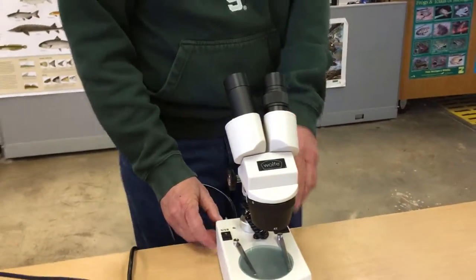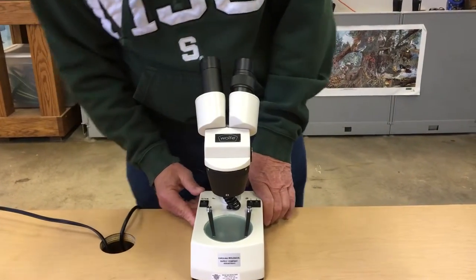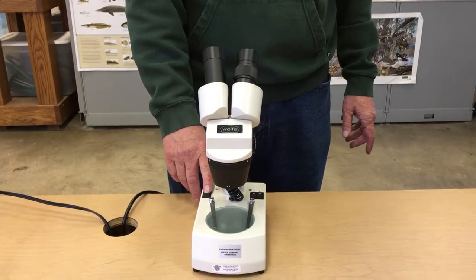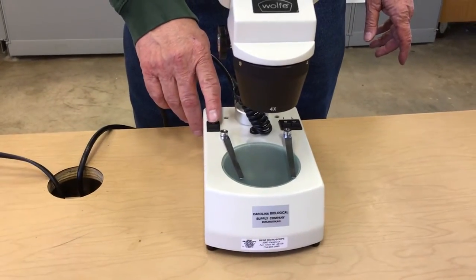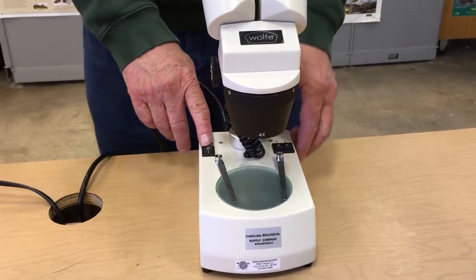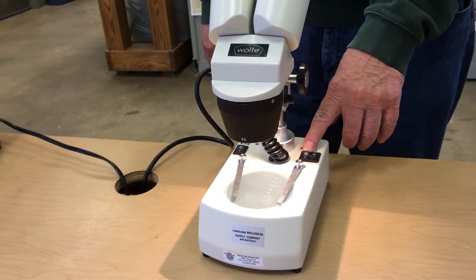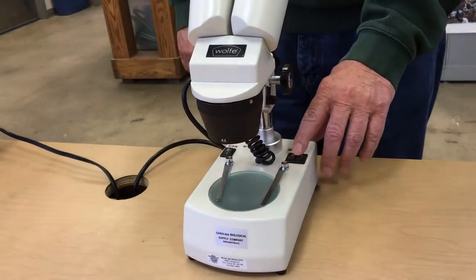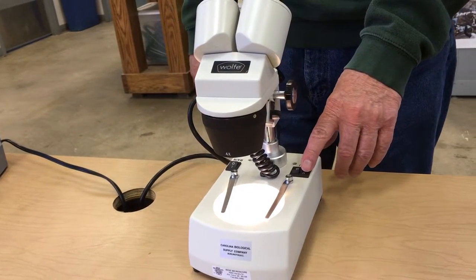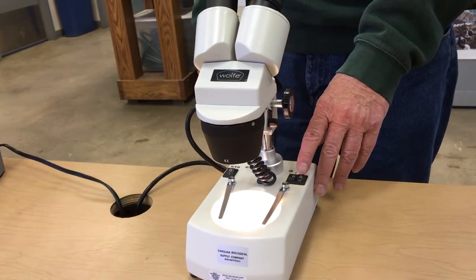Now the other microscope here — I'm not sure of the brand, it's a Wolf — it also has a top and a bottom light, but what you have to do is put the switch on the main and have that on, and then you go over here and this light is going from the top, as you can see, and then you have a light from the bottom. Again, just like the last one, you may need both lights or one — whatever makes you see the best.